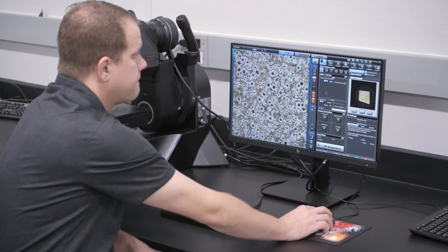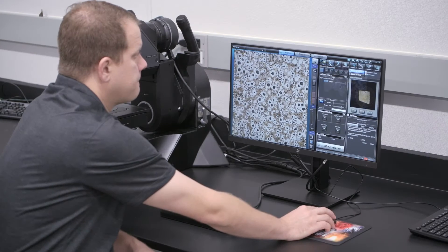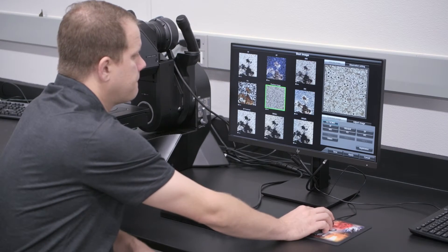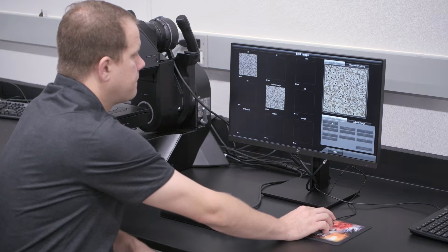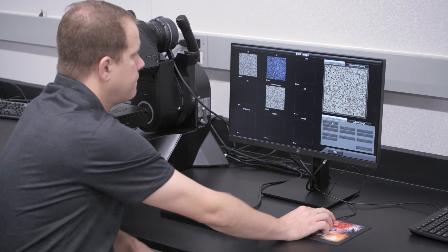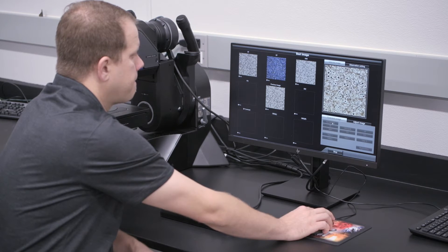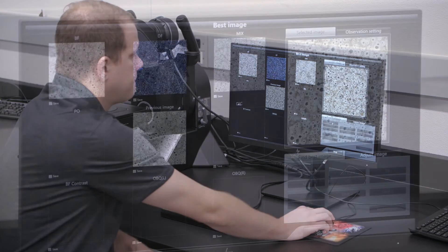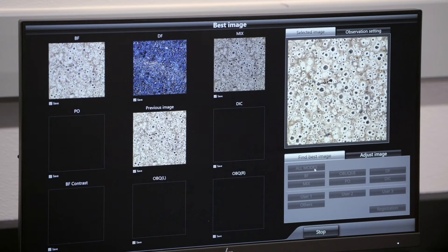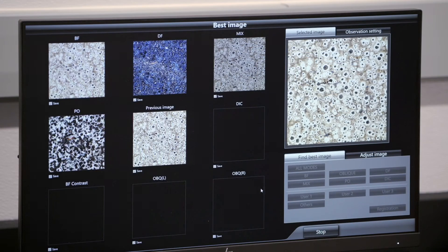The DSX-1000's easy-to-use software enables customers to compare all acquisition modes side-by-side to help determine which mode most readily shows the features of interest in the part.